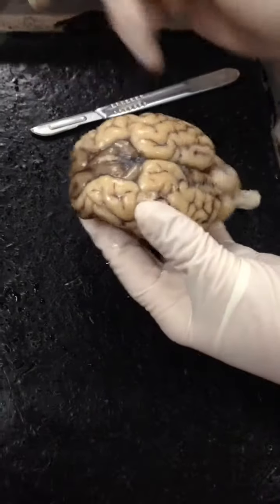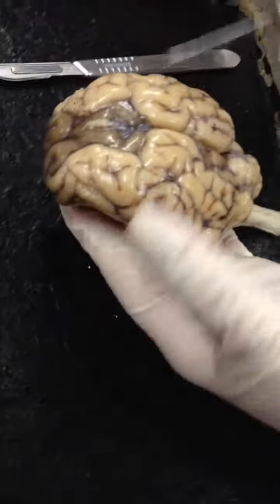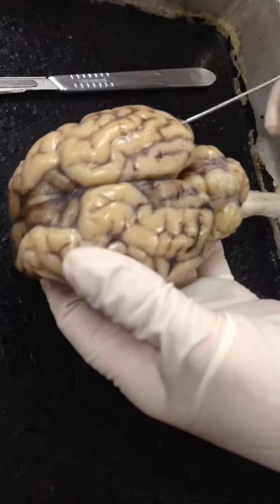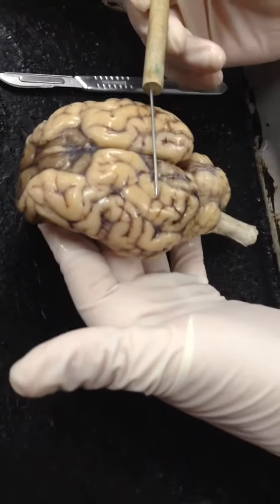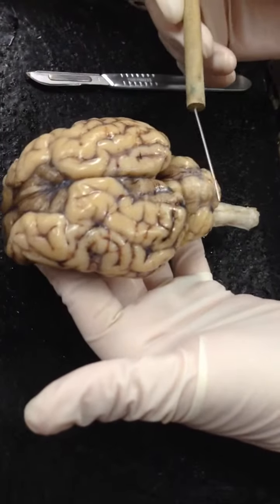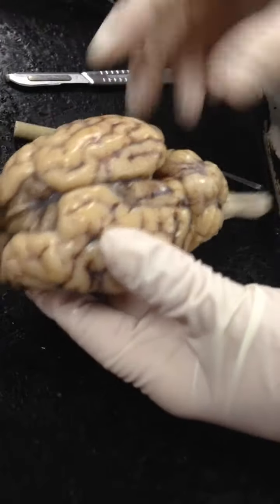Other lobes, right? So frontal lobe, parietal lobe, temporal, and occipital, right? So this whole region here is your cerebrum, and this is your cerebellum, and this is your spinal cord, okay?